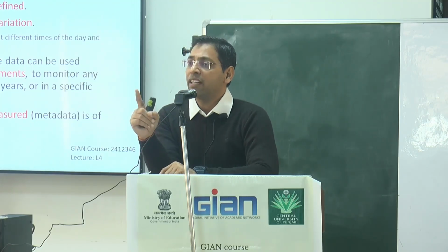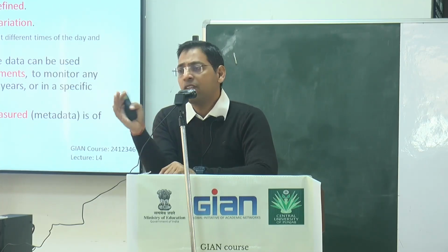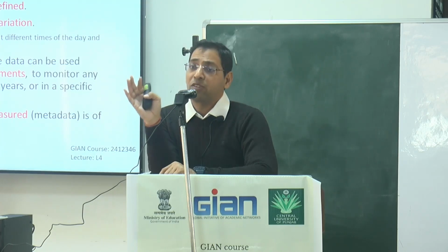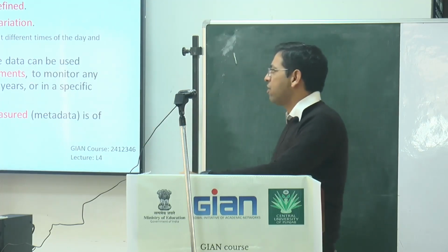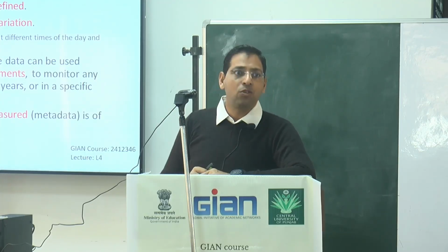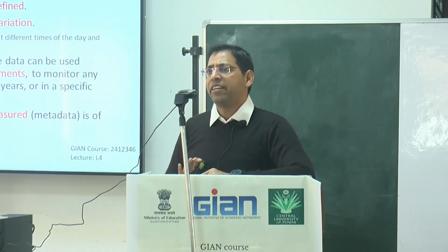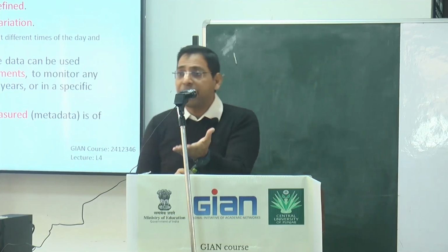If you are thinking that nothing will happen, maybe you will get something different and you are not able to find out those biological variations with respect to the human matrix, then your experiment has failed. So you have to emphasize getting good reproducibility, and if your lab and your work have good reproducibility, then your research is validated. So reproducibility matters.